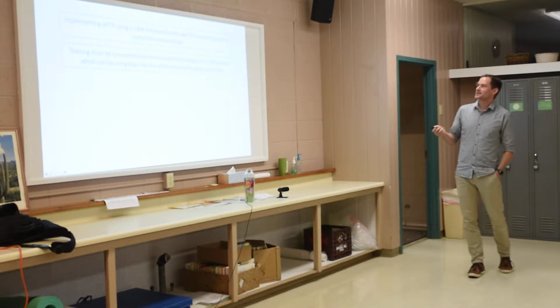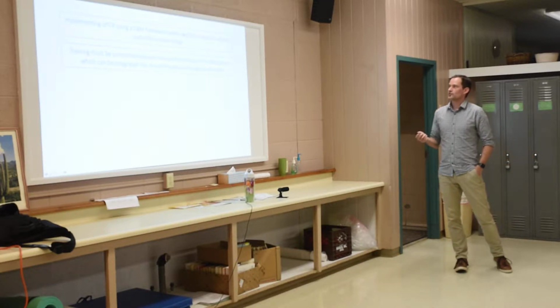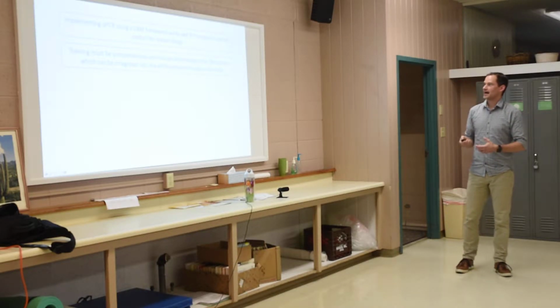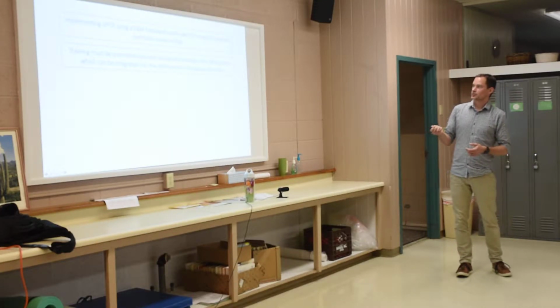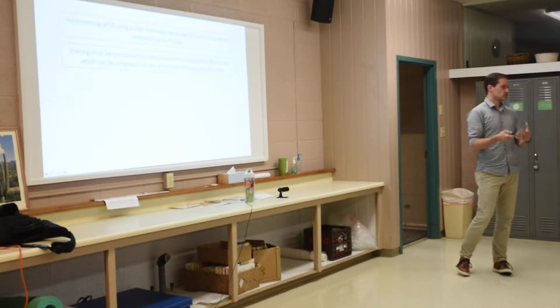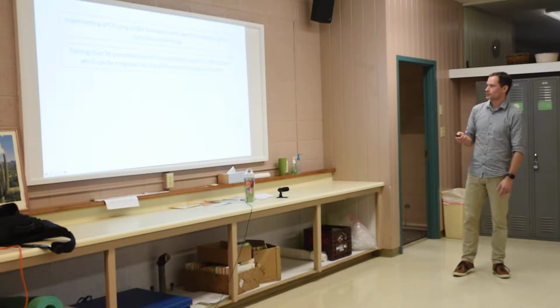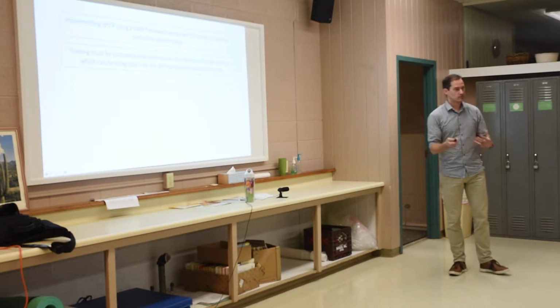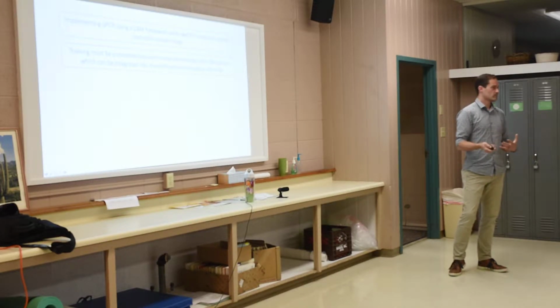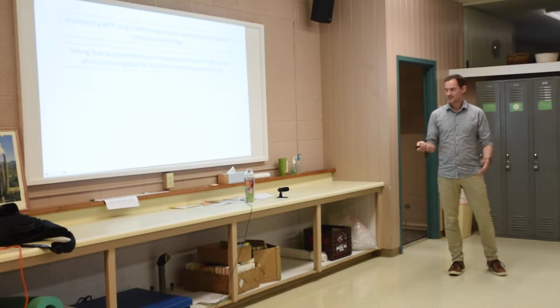So implementing qPCR using a community framework, I think it works really well. And it works best when we have some controls in place to make sure that everything's working properly. We have to make sure that training is comprehensive, and we've done that. We have YouTube videos, we have Freshwater Solutions around to provide direct, hands-on training, and we have lots of written protocols. We also refine those protocols routinely based on feedback from our CBM partners, because if you read something and you don't know what it means, that means it's not written right because you didn't understand it. So we should change it.